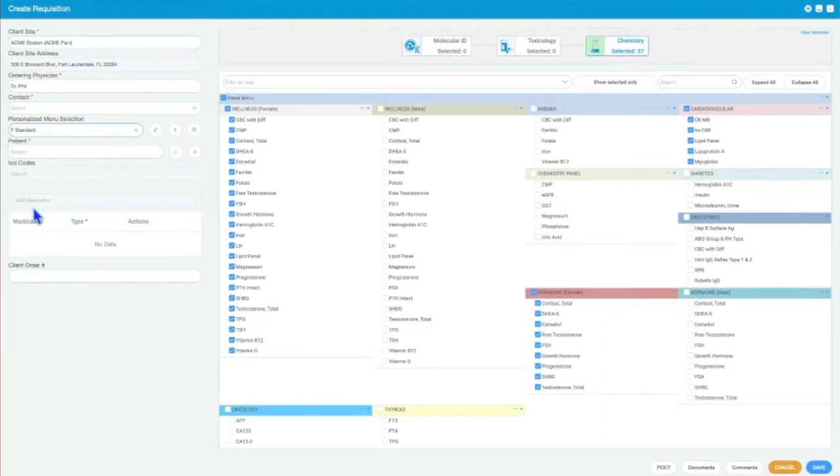So if I do this, boom, it selects them automatically. So it gives me the option as a user, as a doctor, to have my own preferences, or my own subset. Now for your patient, you can choose search from an existing patient. You can see when I select the patient, I have this magenta showing up. We use that color just because it pops out with everything else.